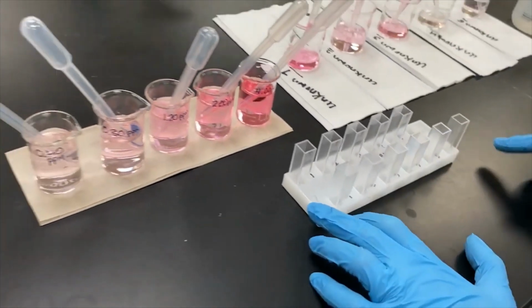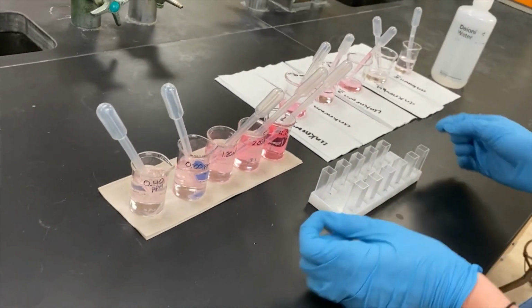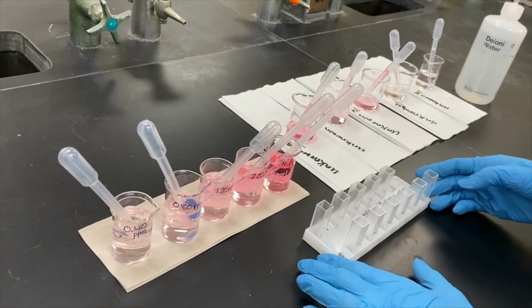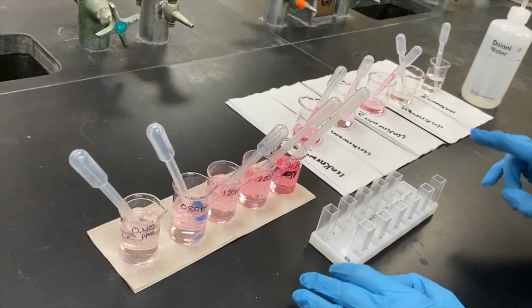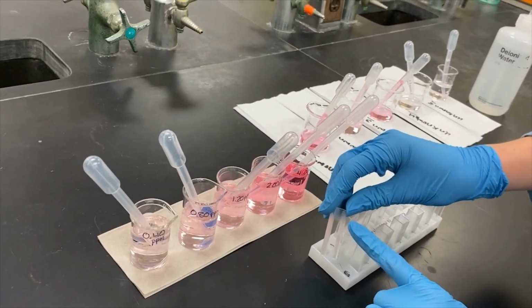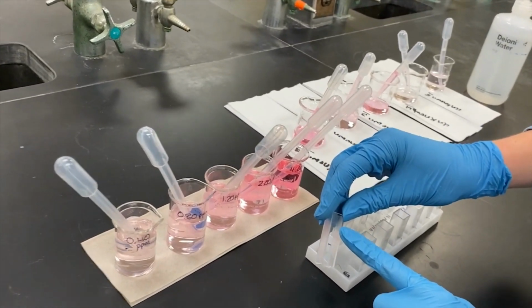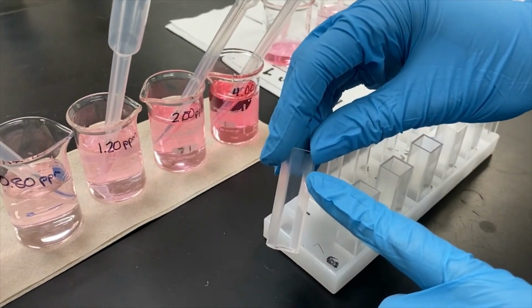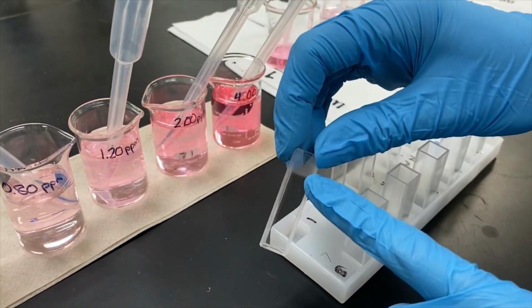So I'm going to follow what they did. Sometimes you get lucky with a blank slate, or you can follow someone else's. It's not too crazy either way. They say to add about 2 milliliters of the solution in here, but my goal is to essentially fill around this line.